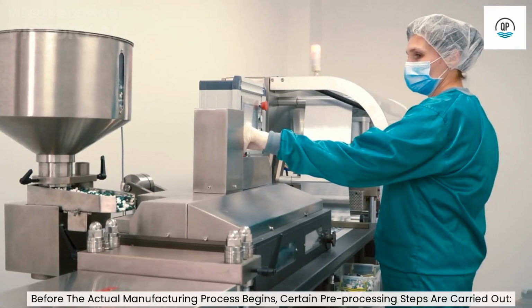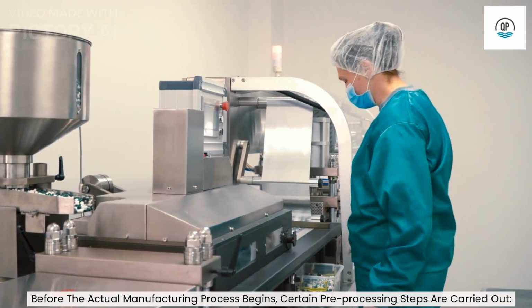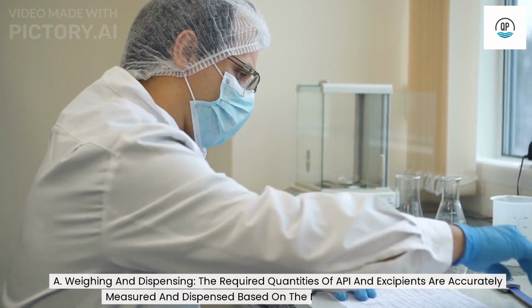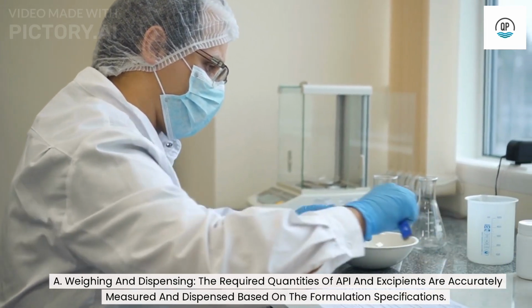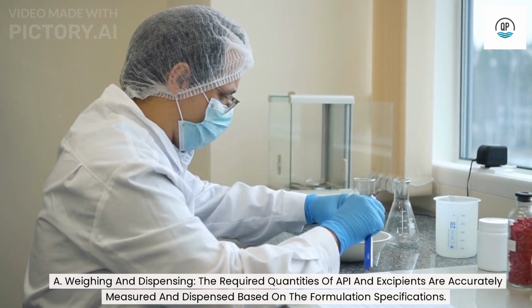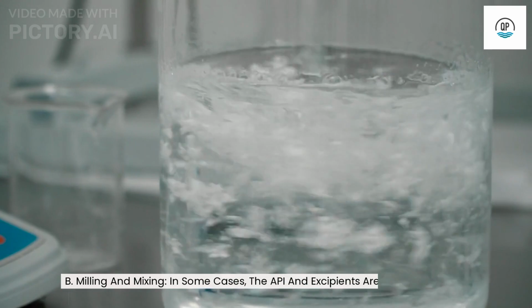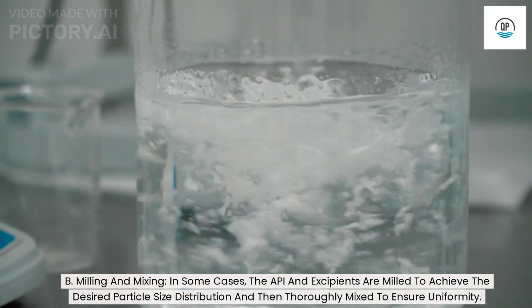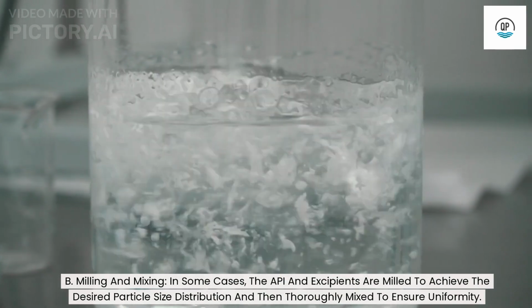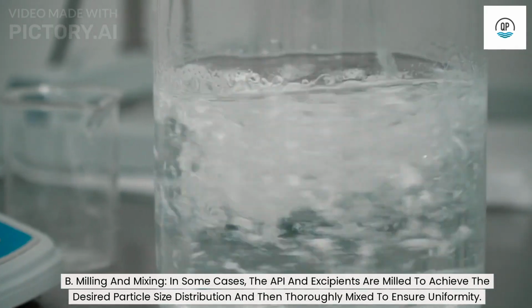Before the actual manufacturing process begins, certain pre-processing steps are carried out. A. Weighing and dispensing. The required quantities of API and excipients are accurately measured and dispensed based on the formulation specifications. B. Milling and mixing. In some cases, the API and excipients are milled to achieve the desired particle size distribution and then thoroughly mixed to ensure uniformity.